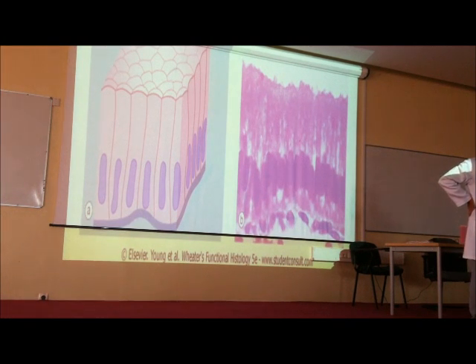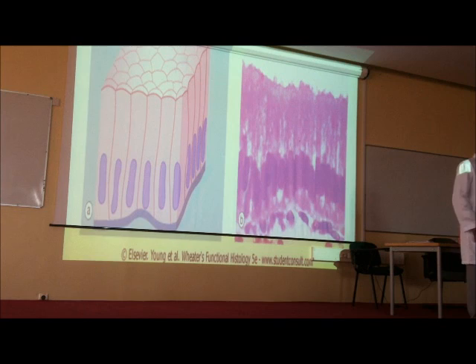Where can you find the ciliated type of this epithelium? Fallopian tube, uterus and the fallopian tube. Okay? Where can you find this type having a brush border? Small intestine. So I will give you alternatives. You will choose one of them, A or B or C. Okay?